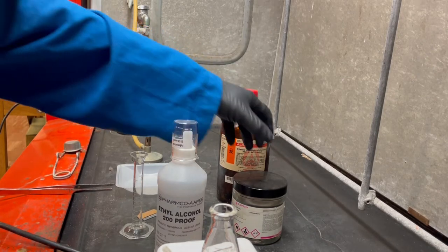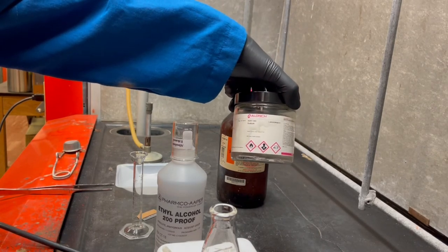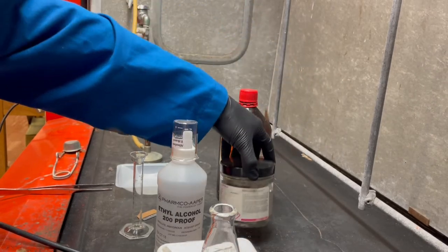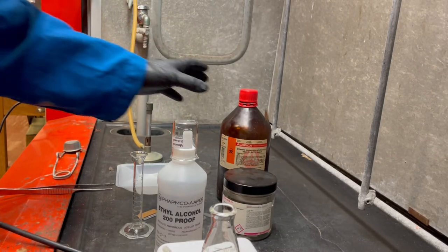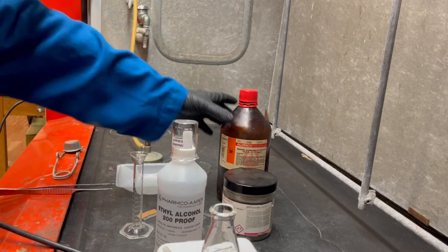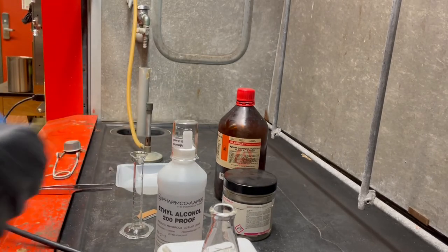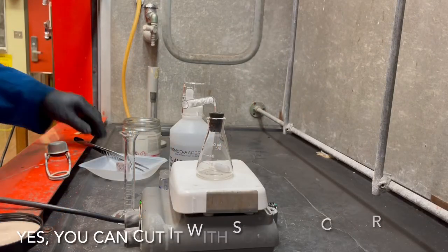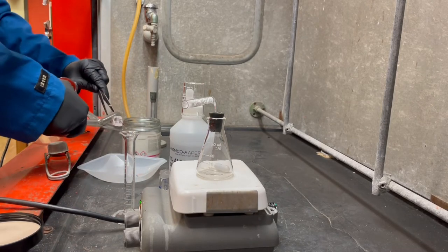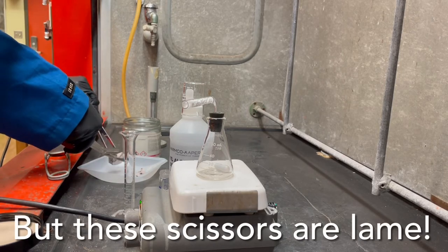Oh, and I forgot to mention, the sodium should be in oil. Does it say on here? Oh, it's in kerosene. But generally what we're going to do when we cut up our pieces, or whenever we make it nice and clean, we're going to dip it into xylenes and then wipe that off before we add it to our ethanol. All right, so here we go. I'm about to cut up some elemental sodium here, basically just cutting that oxidized layer off of the outside.